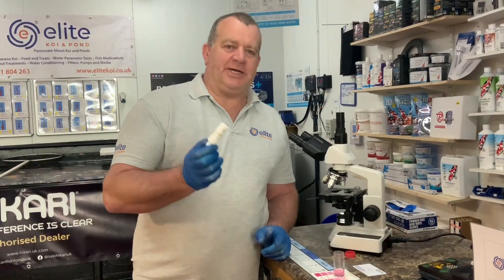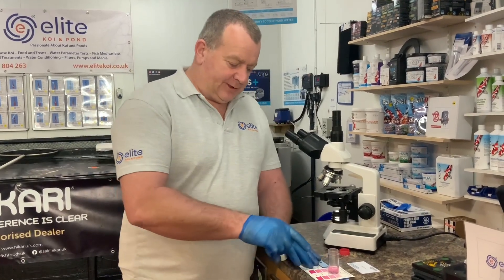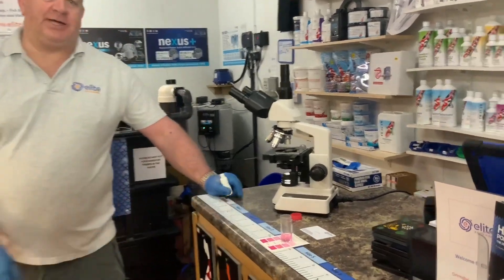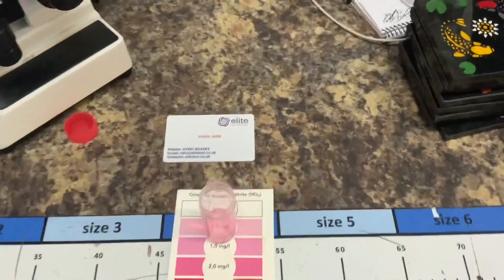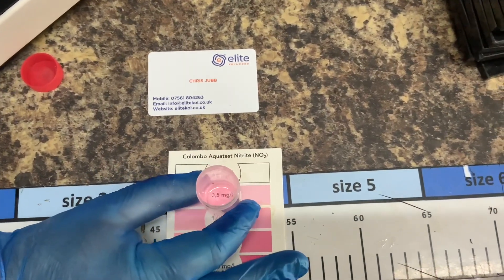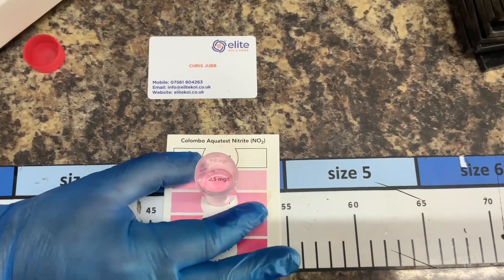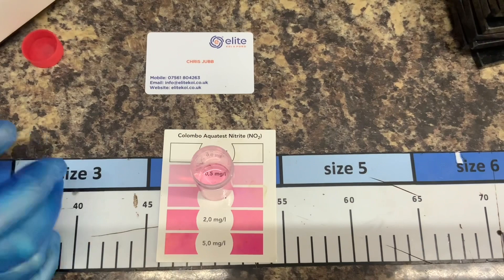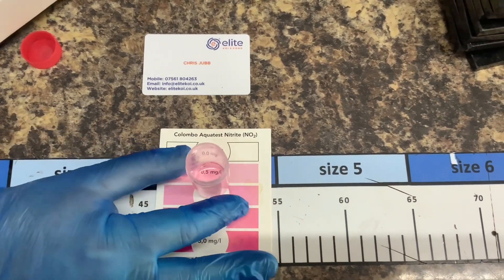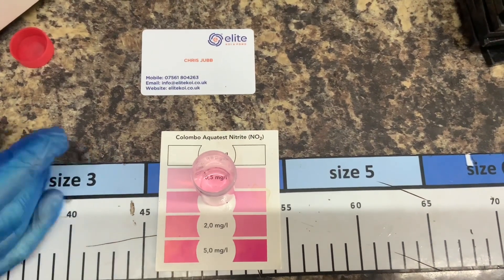We've just done the nitrite test on Will's water. Lo and behold, after five minutes there is a trace of nitrite in the water. That is around the 0.5 to 1 milligram per litre mark — fully expected at this time of year. I'm not surprised or shocked to see that nitrite. What we'll do is keep an eye on that over the next two or three weeks and hopefully it'll start reducing.